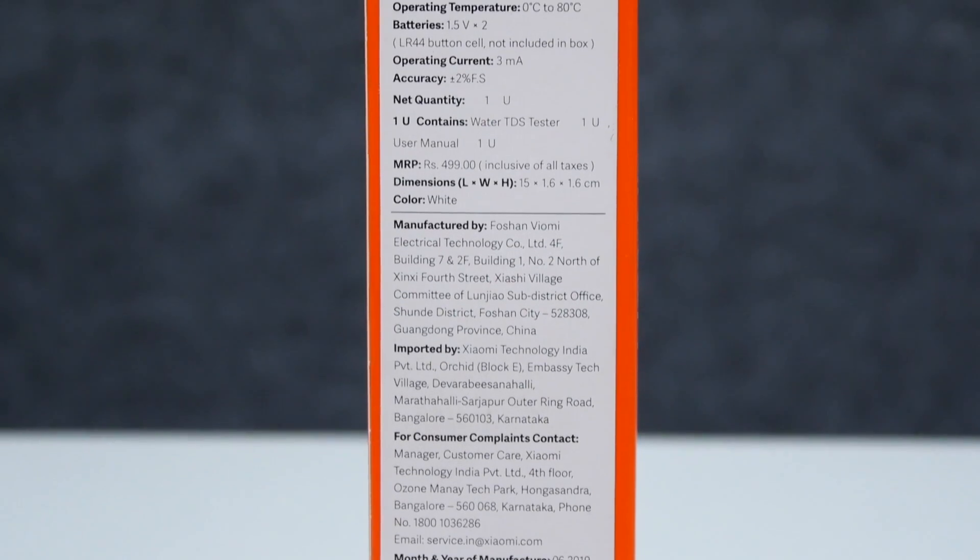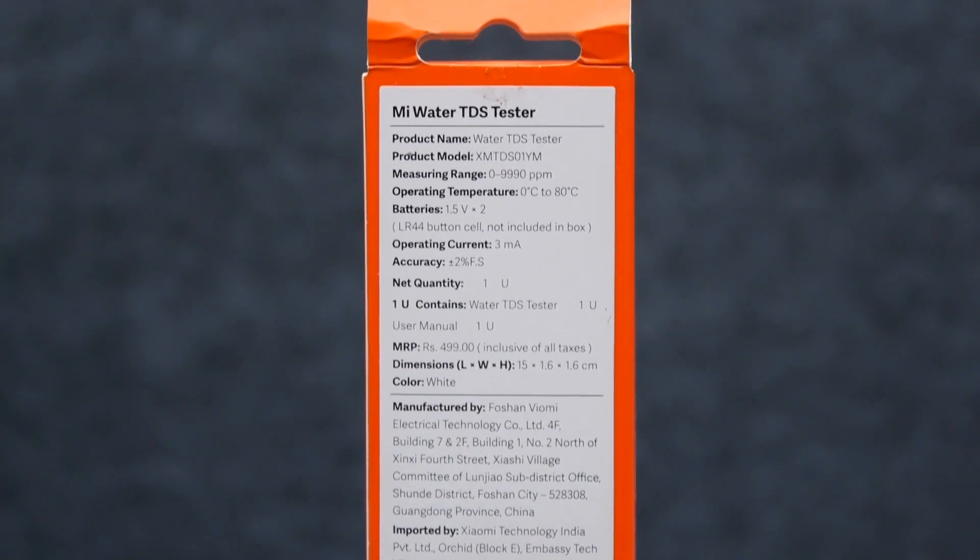The device runs on batteries — 1.5V, two LR-44 button cell batteries. Note that the batteries are not included in the box.